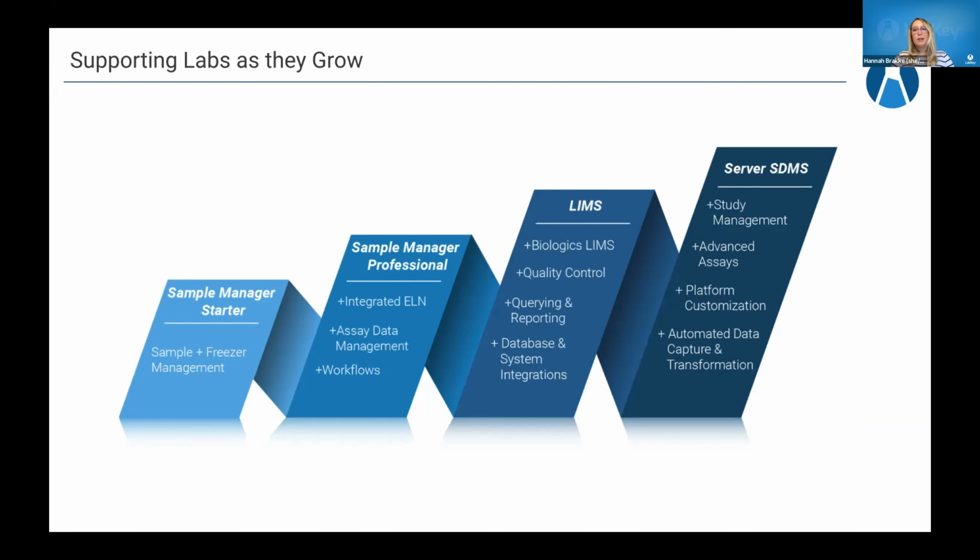And then lastly, of course, our LabKey server scientific data management system. This is something that almost all of us probably are really familiar with, and providing this growth path to this point where you can have enterprise level, company-wide scientific data management with a single application is really powerful.